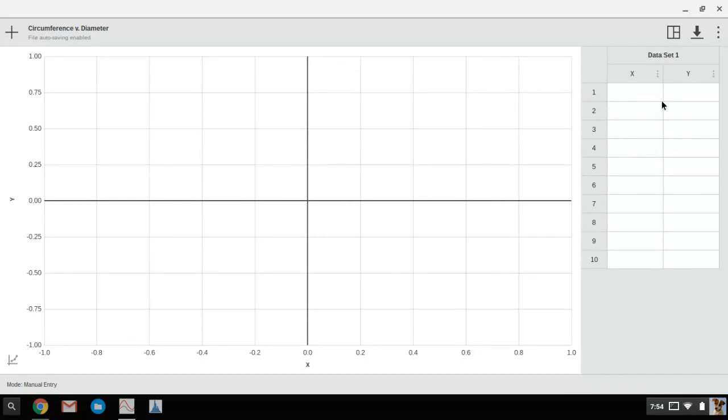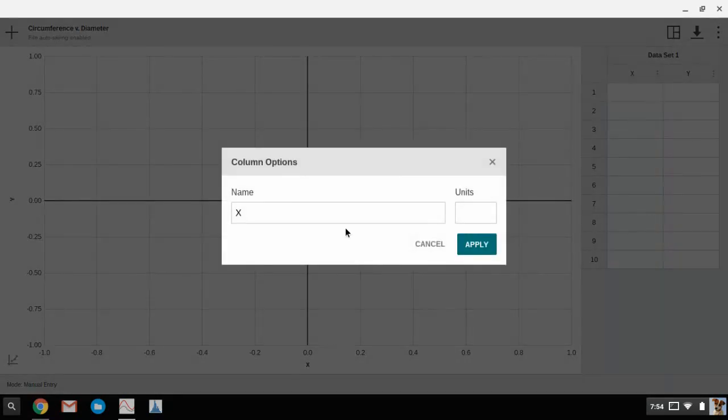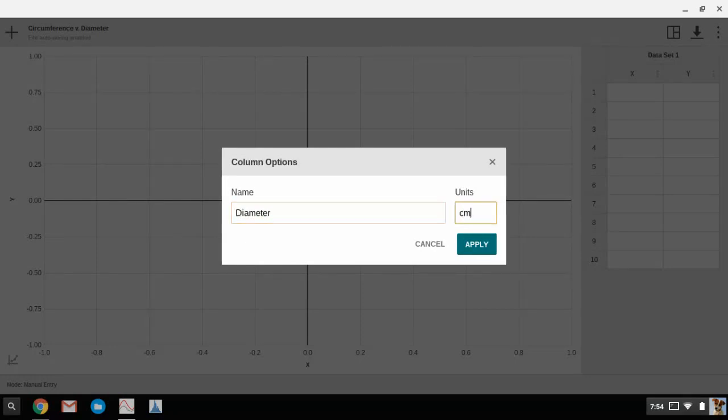Then enter in your data. Over here on the right hand side we have the data table, and by the X column we have column options. You click on that and you can enter in whatever your independent variable is, what you want to plot on the x-axis, which for me is diameter in centimeters.